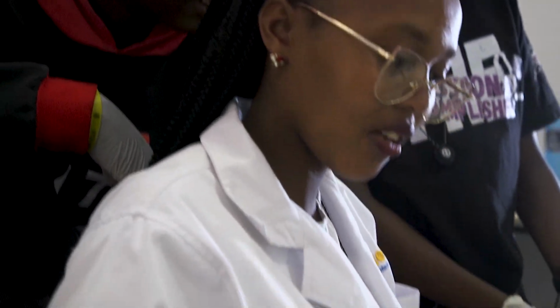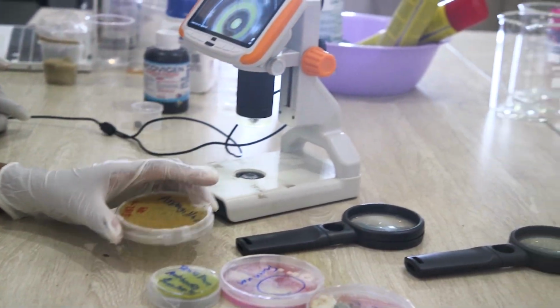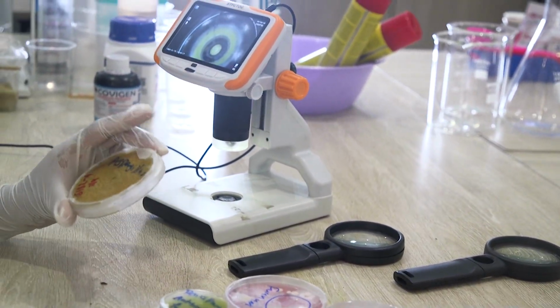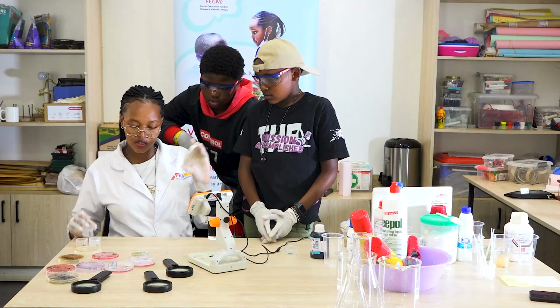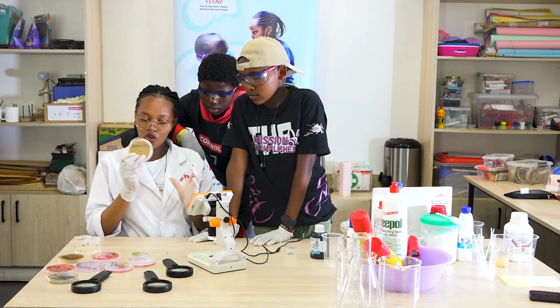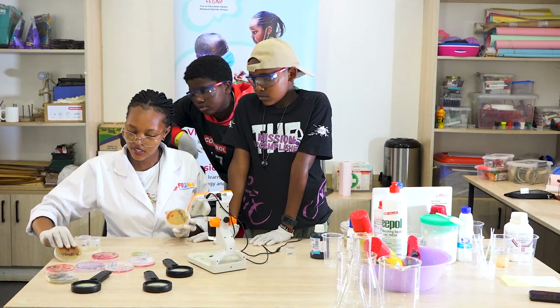So for the live animals, and then next we'll view this. These are microorganisms, and these are macro organisms. Micro is small, macro is big. For this, we have several aspergillus.